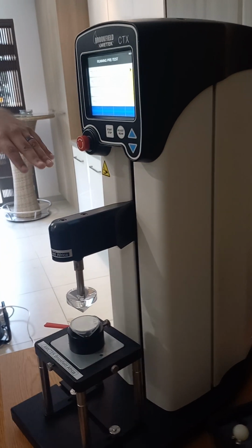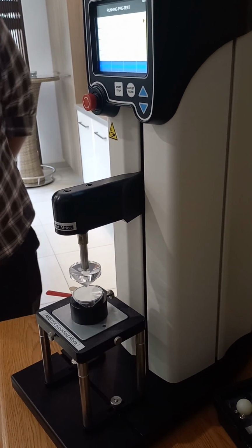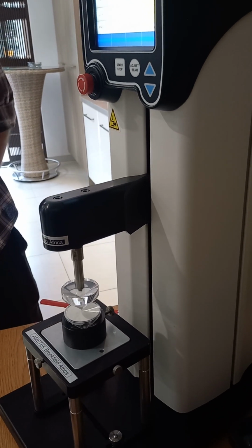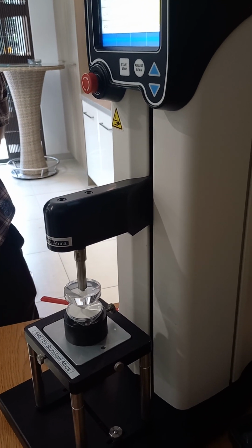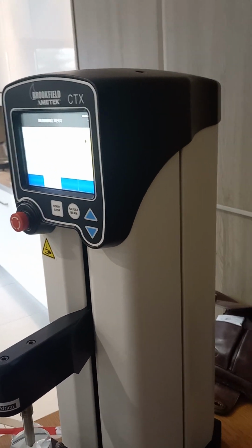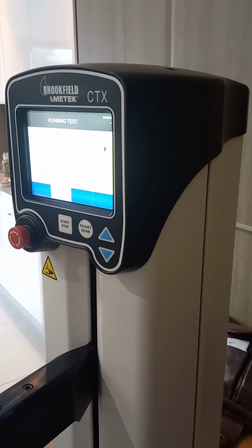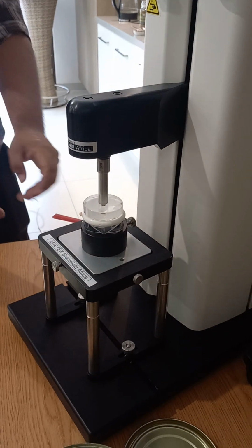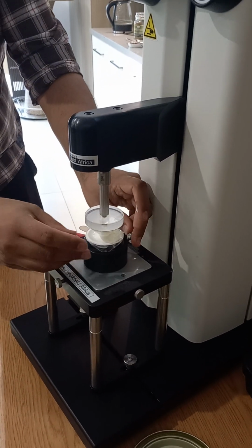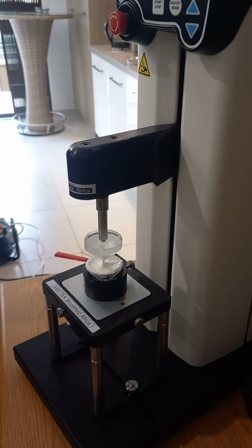Okay, so we're moving downwards. You see the load value is below 2 grams there. Once it touches that sample, it's going to sense a force being applied to the probe. And you hear a beep. You hear that beep. So now it's going into the sample. It's analyzing the forces involved. It's going down 15 millimeters, and it comes back up. Sticky. Yeah, that's actually my fault. I was supposed to secure it. But we can just do another test very quickly.